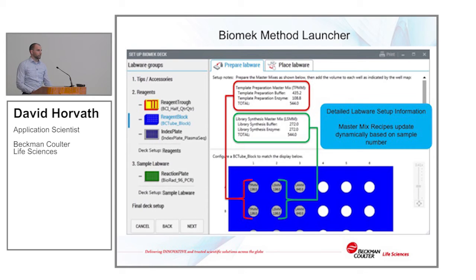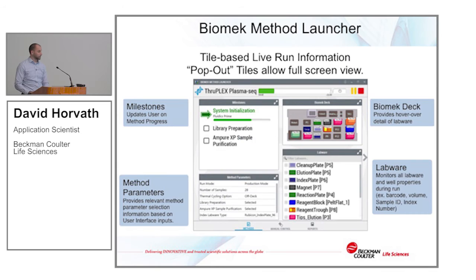It will guide the user exactly where to place reagents, prevent errors from calculating the master mix volumes themselves, and be very clear as to which wells those reagents are supposed to go into. And then once the plate is filled, it'll instruct the user with the next tab where to place the labware on the deck. So after the deck is set up and the user's ready to run, they are presented with the actual method launcher live view.